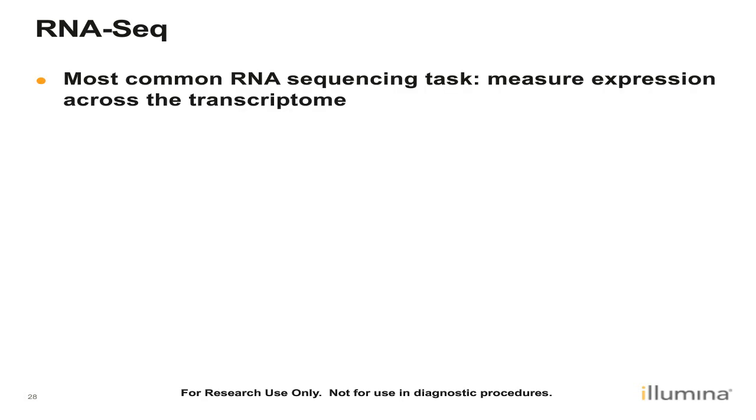Okay, let's switch gears again and talk about a totally different application. Let's talk about RNA-Seq. Here, the most common RNA sequencing task is that you want to measure expression across the transcriptome, or measure how much expression there is for a particular gene or transcript.